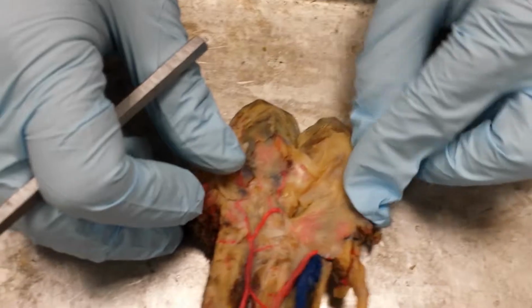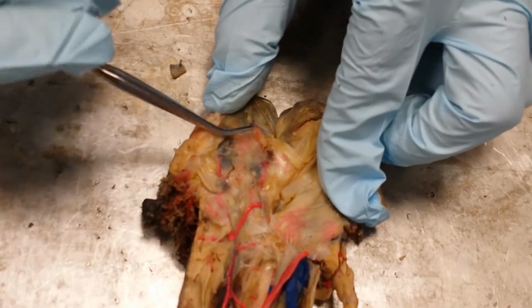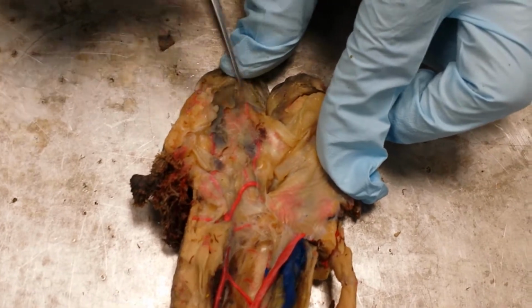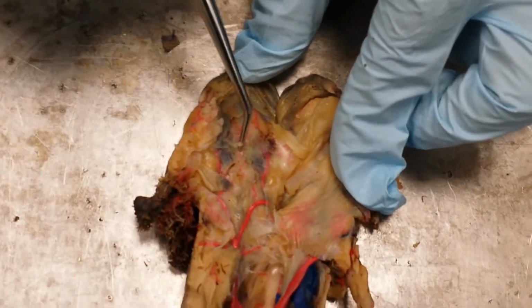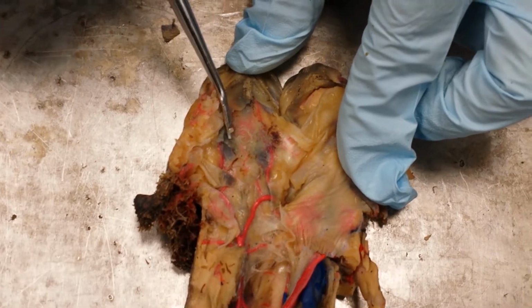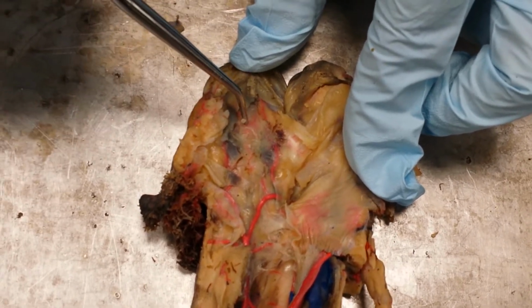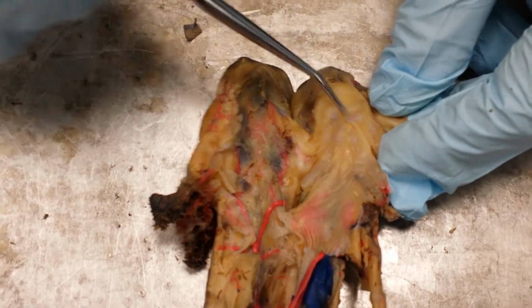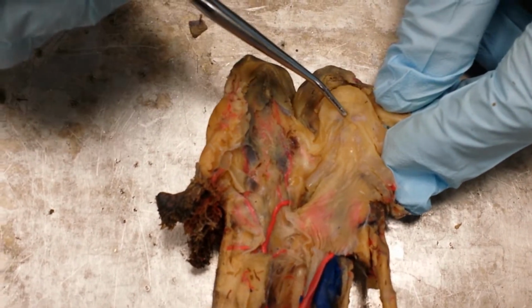And a couple things you're going to notice. First, you're going to want to peel the skin off the dorsal jaw area. And you'll notice that this big plate of bone here that's formed from the chondrocranium is the hard palate, and this thing on the ventral side is the tongue.